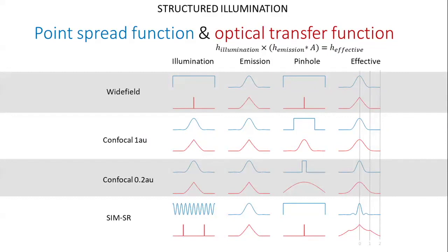We go into confocal, that function changes shape and now becomes a Gaussian. So it's got a smoother decay down here at that hard cutoff. We shut the pinhole down, it gets broader, so we can see a bit more high frequency information. So here is where the super resolution business is coming. We're getting amplitude in the optical transfer function beyond the normal Abbe cutoff. And then with the structured illumination, the grating illumination pattern, we can take it out by a factor of 2 before it decays all the way down to 0.